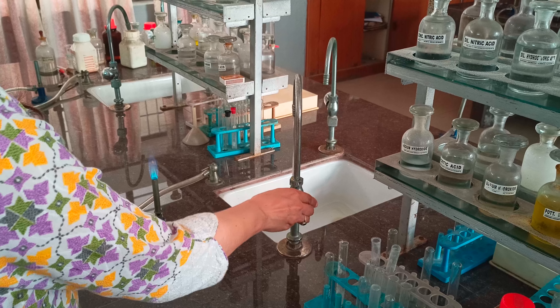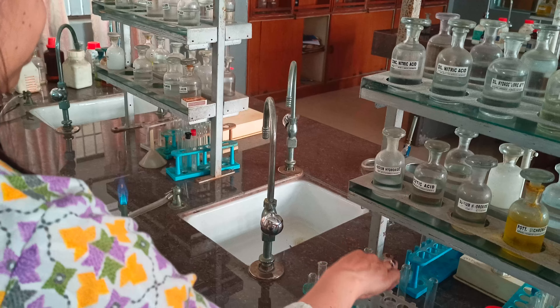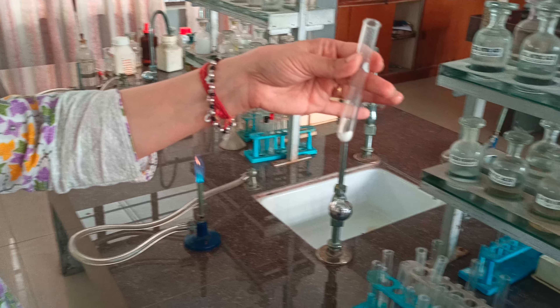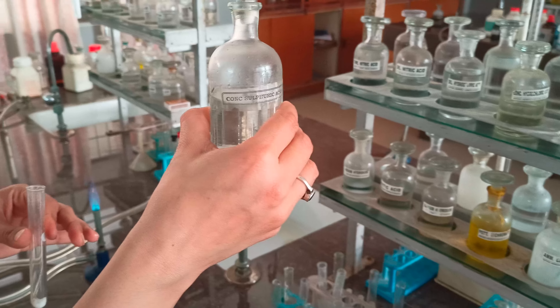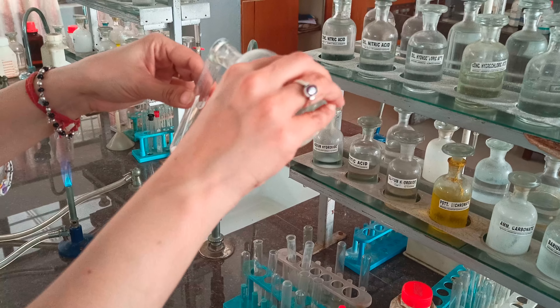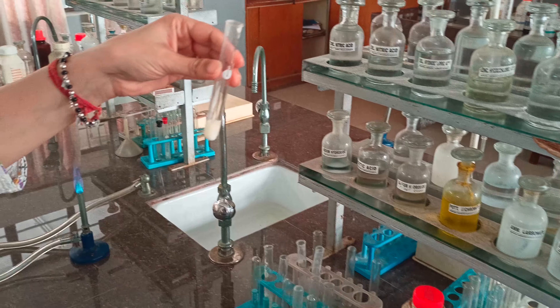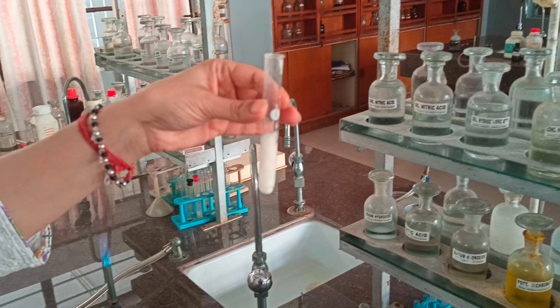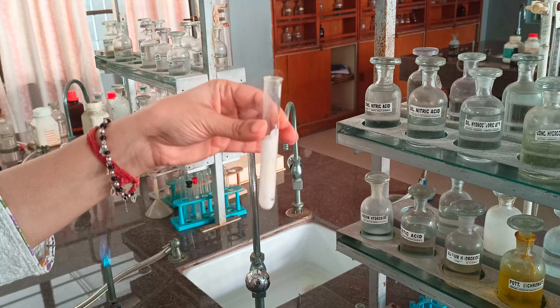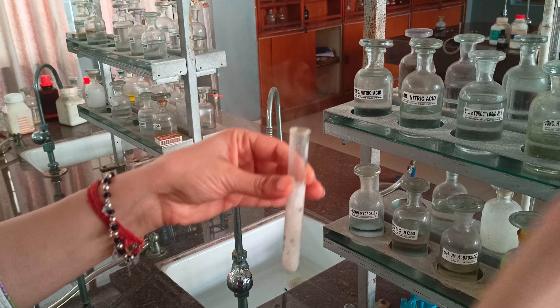In another test tube, we will take the salt and add concentrated sulfuric acid. You can see dense white fumes and a pungent smell — HCl gas is coming up.